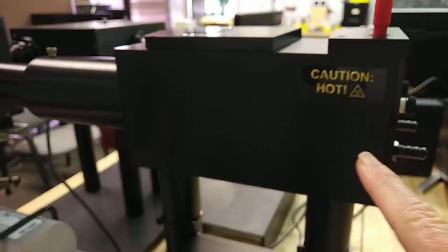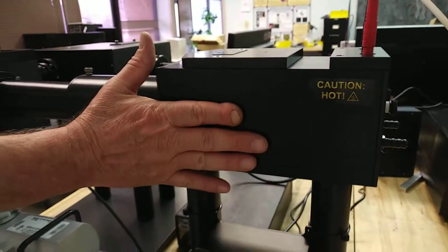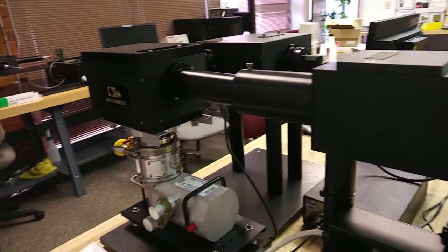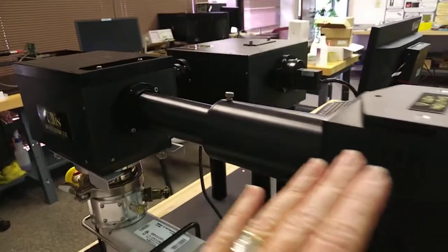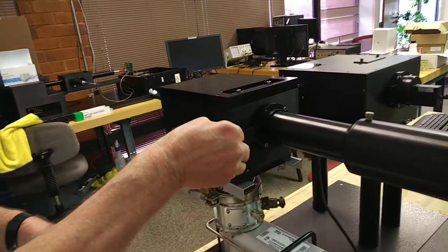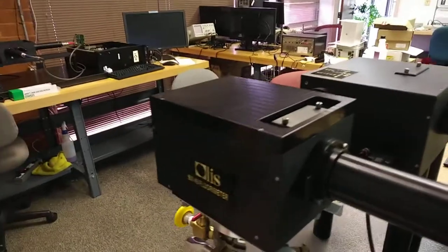Caution: my hand just touched this lamp housing — it is warm. So just be aware of that. That heat travels through this tube to the sample compartment, and you might occasionally need to protect your sample from it, depending on how heat sensitive it is.